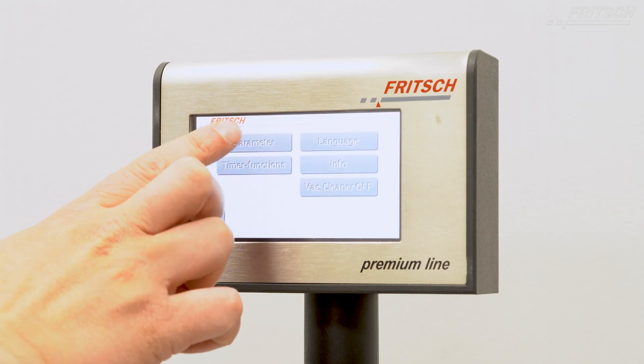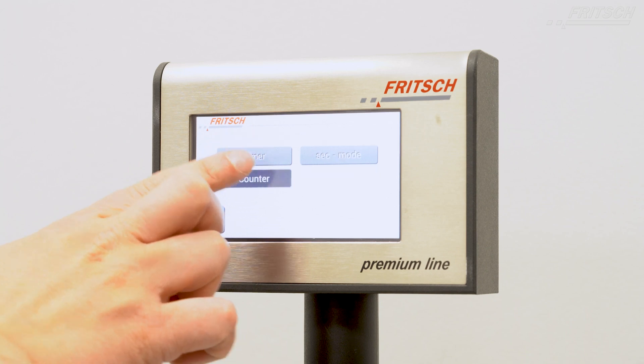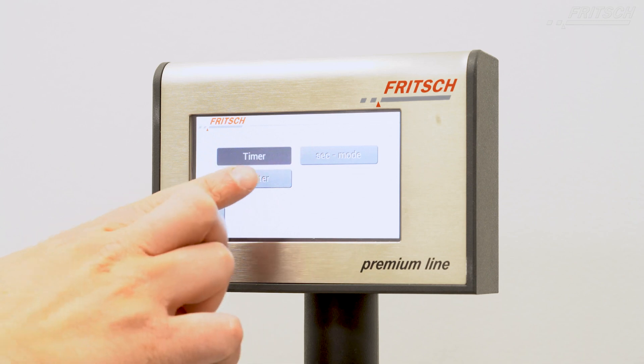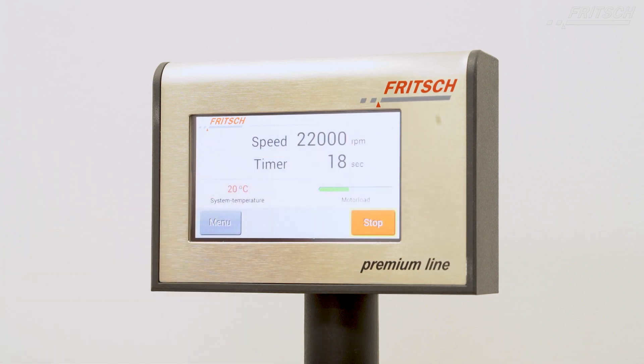The Pulverisette 14 Premium line is operated with the ergonomically arranged touchscreen with intuitive menu structure in different languages. Displaying the power consumption and system temperature ensures easy control, and a warning is shown in case of overload and overheating.